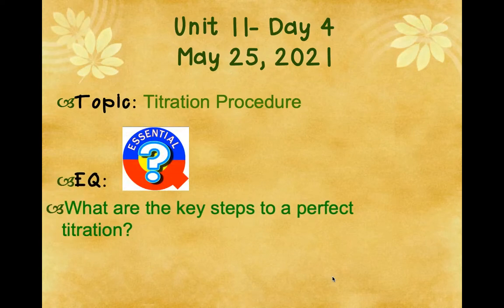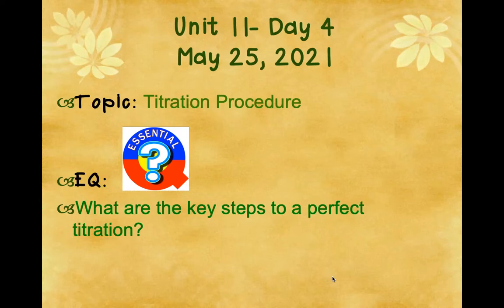Our essential question is, what are the key steps to a perfect titration? And I'm going to try to show you a perfect titration also, in addition to getting those key steps. So knowing what they are and seeing them. Pause the video if you need more time to set up your focus notes. When you're ready, let's go.